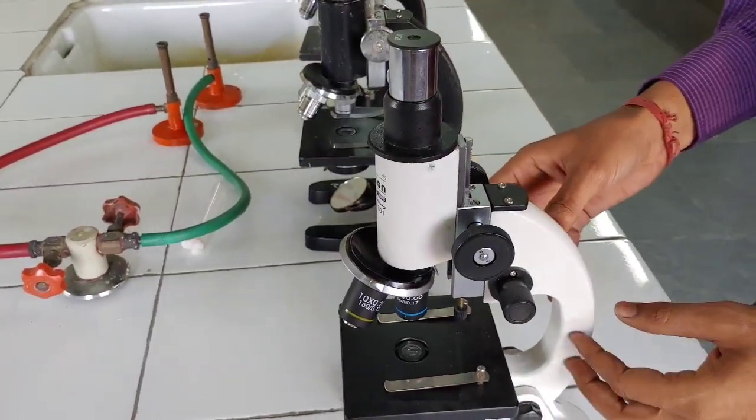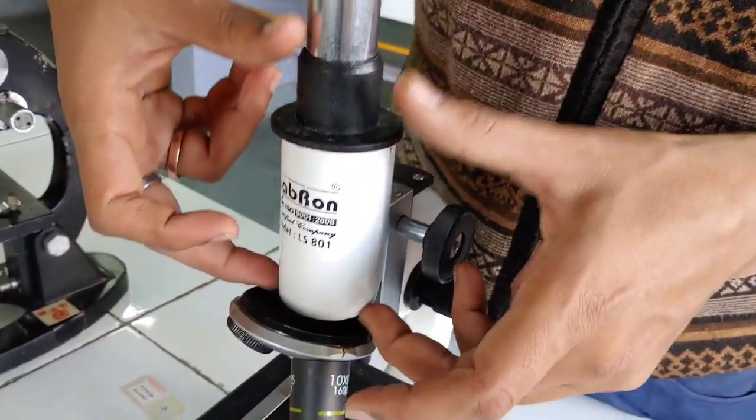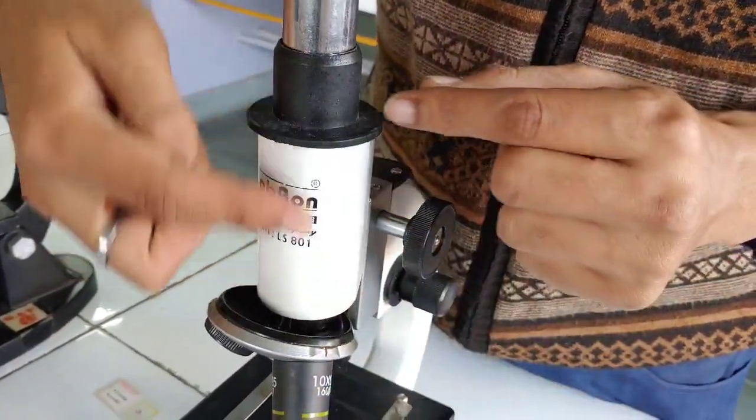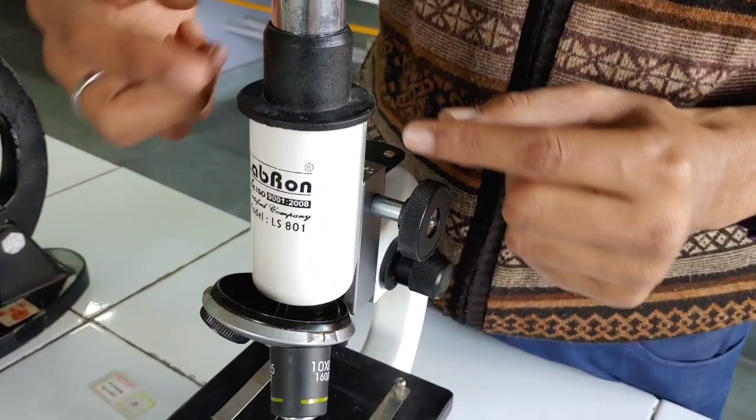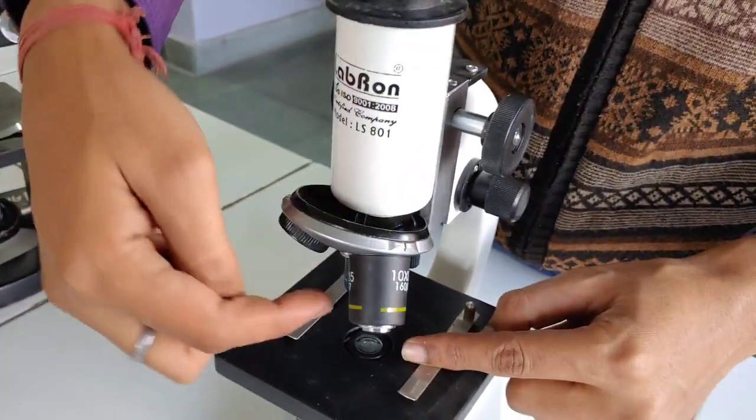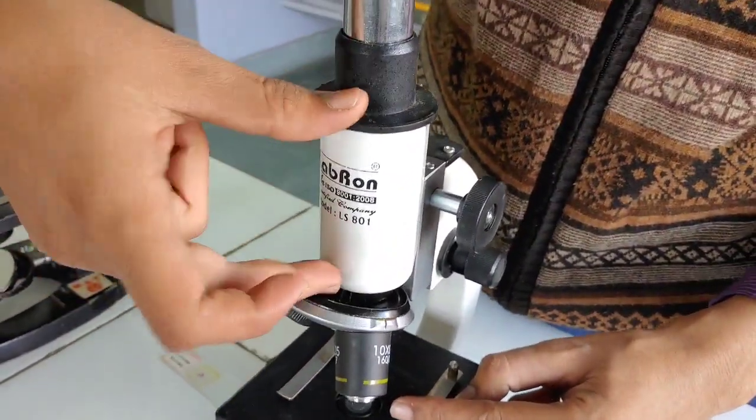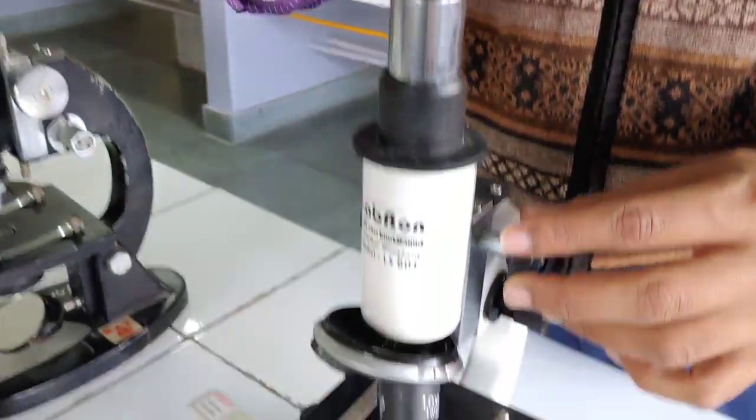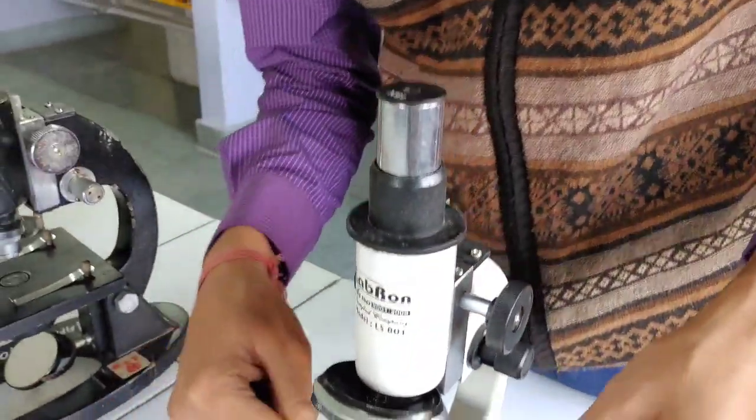Arm is curved set or C-set and it supports the magnifying and the adjusting system. Next is body tube. It is a tube which helps to locate the lens and through which light passes.